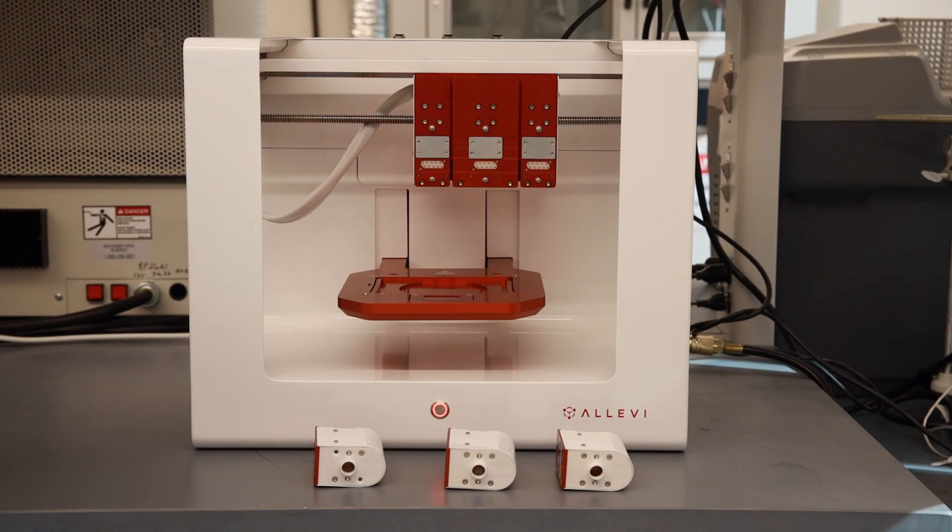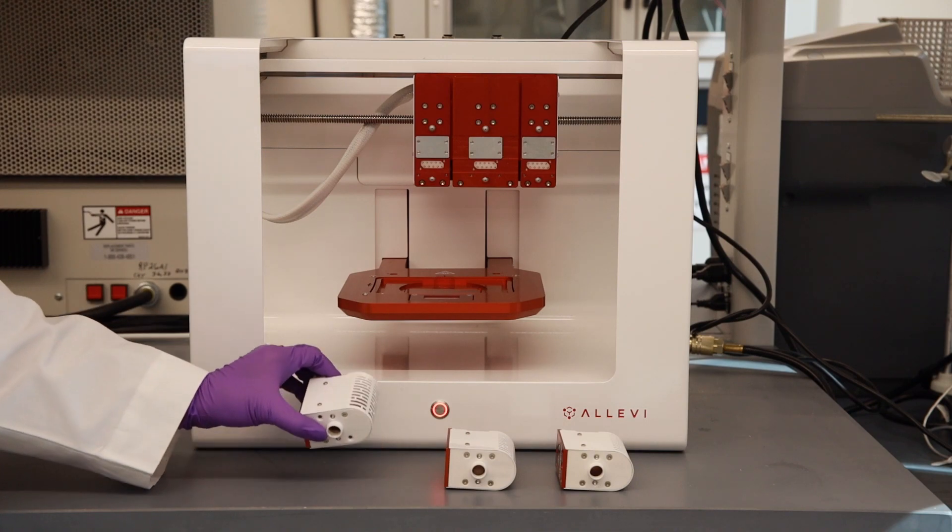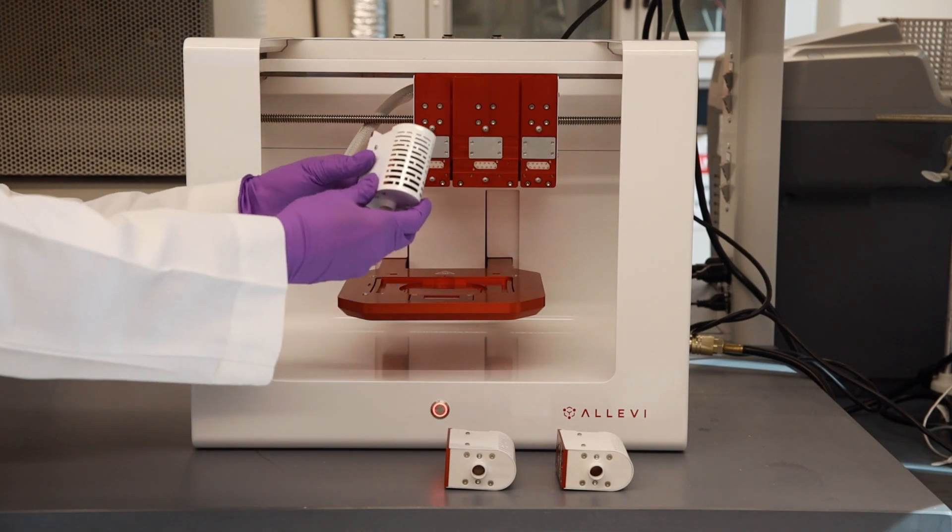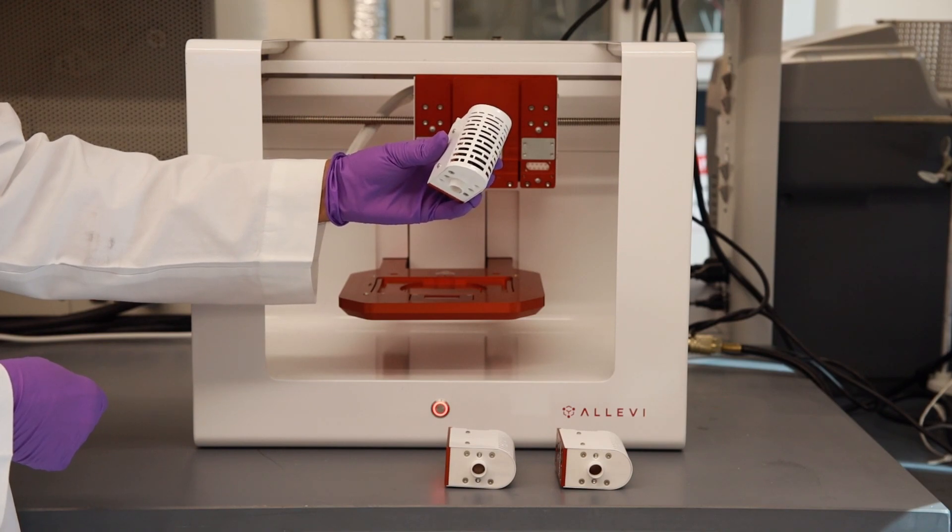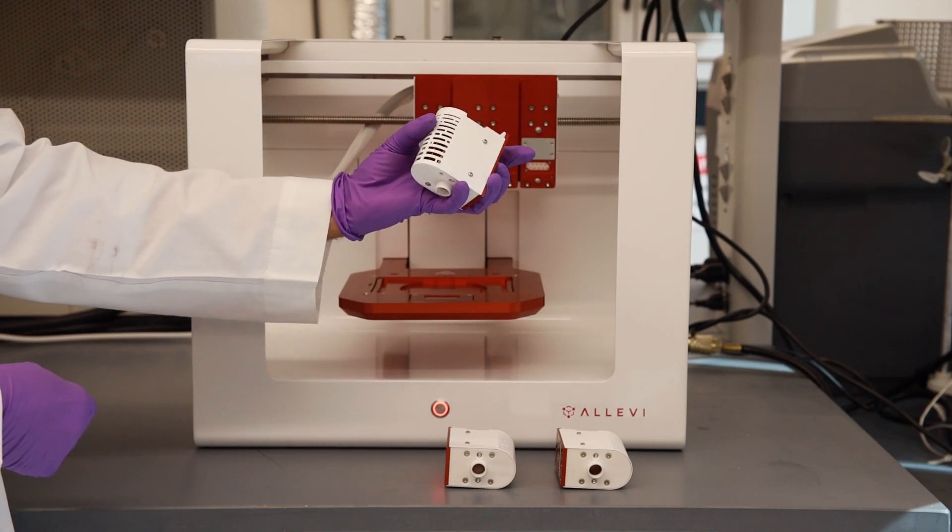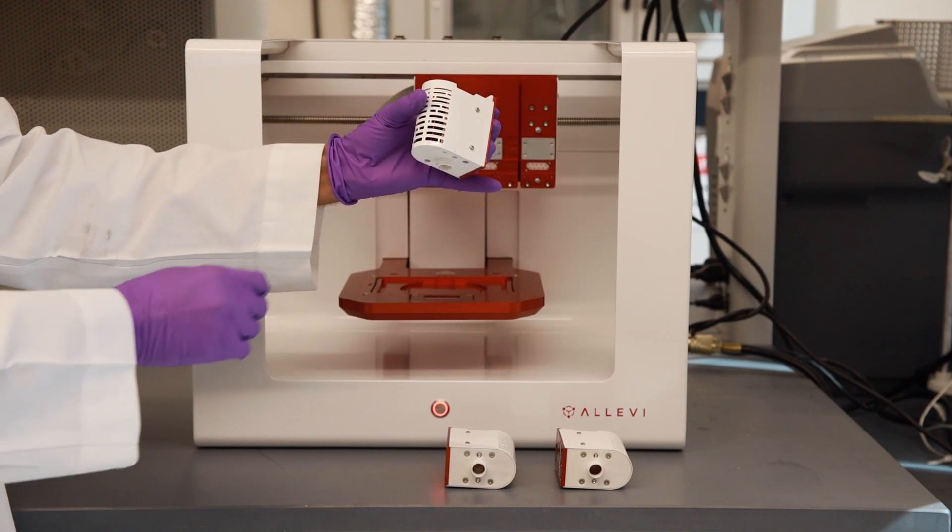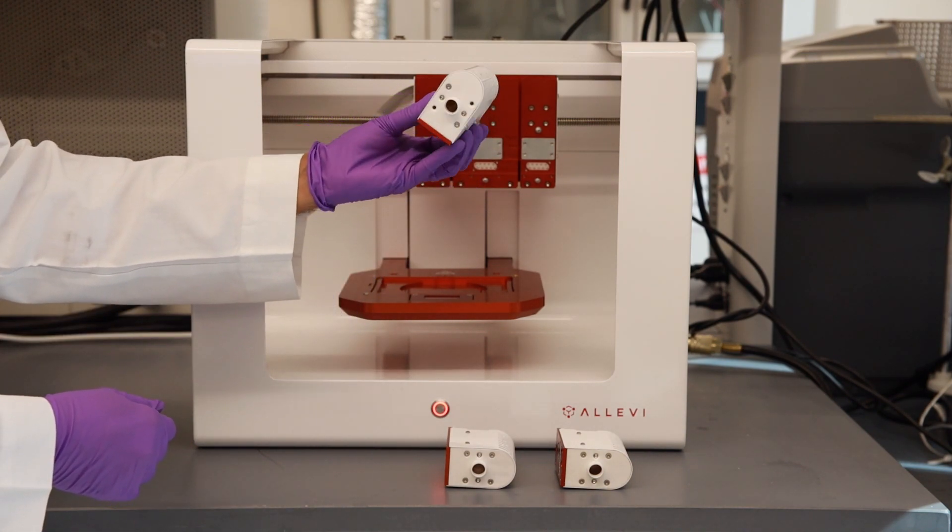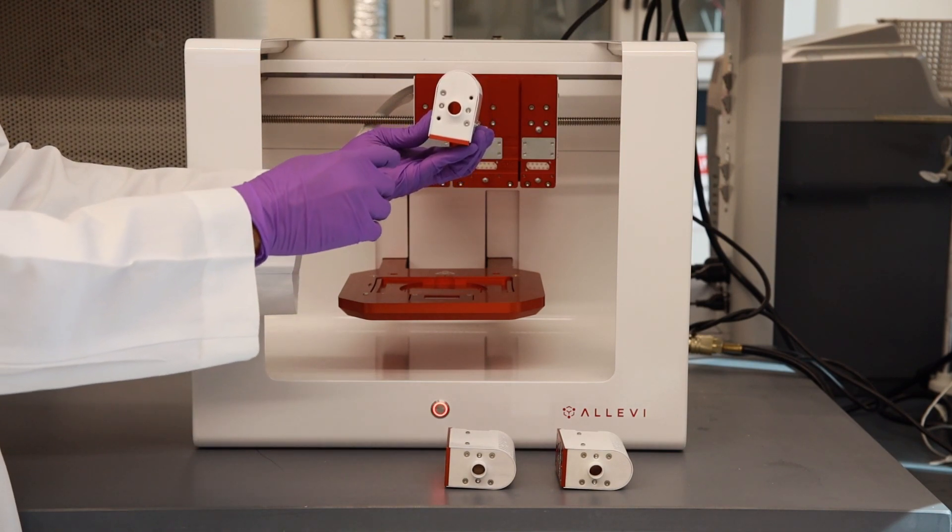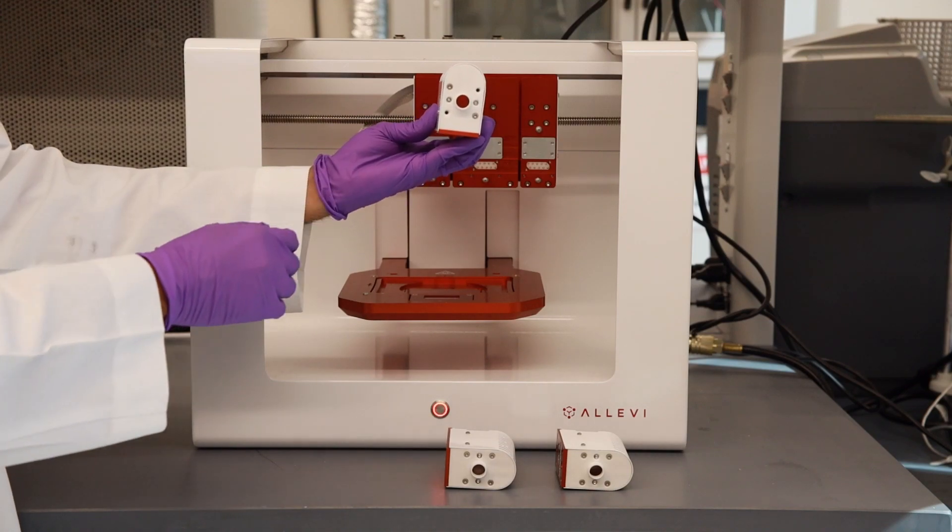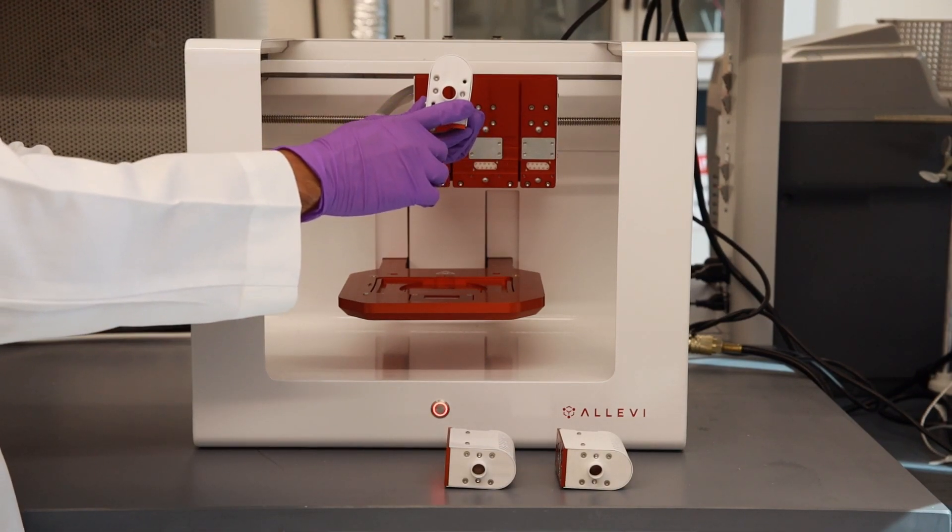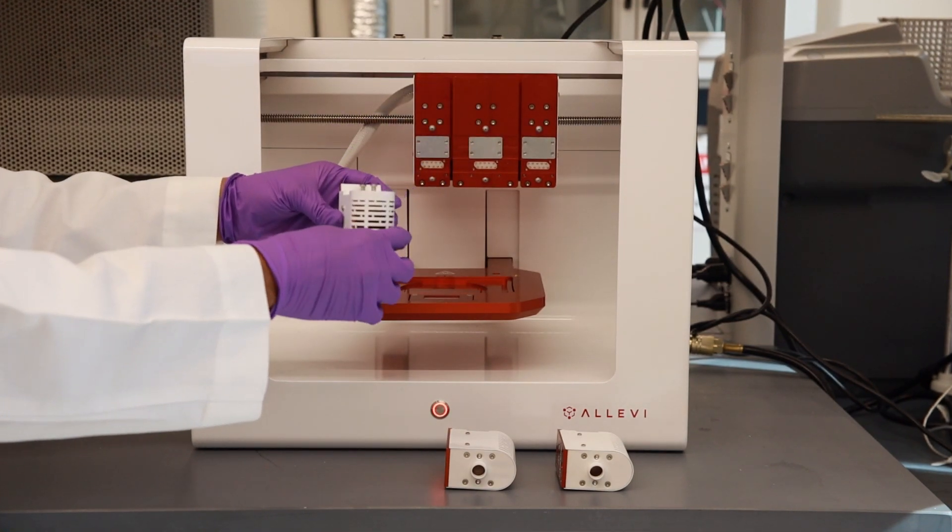The Alevi bioprinter can accommodate three printheads. This translates to being able to print with three different materials at the same time. These are extruders, also known as the printheads. These can heat the materials up to 160 degrees Celsius or cool them down to four degrees Celsius. The printhead has two LED lights for photo curing. One LED provides 365 nanometer wavelength light and the other provides 405 nanometer wavelength light.